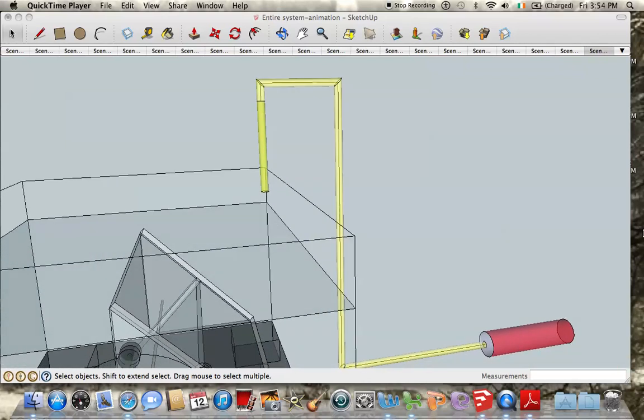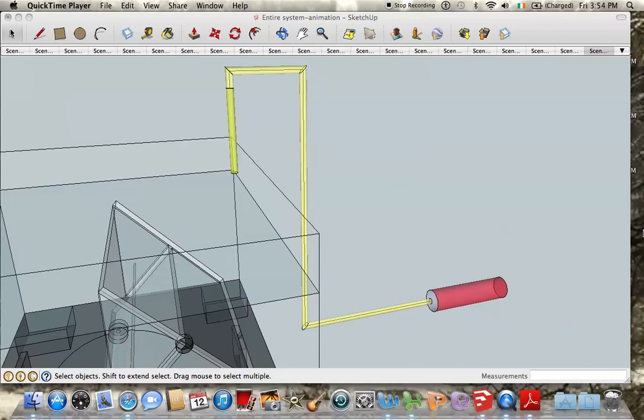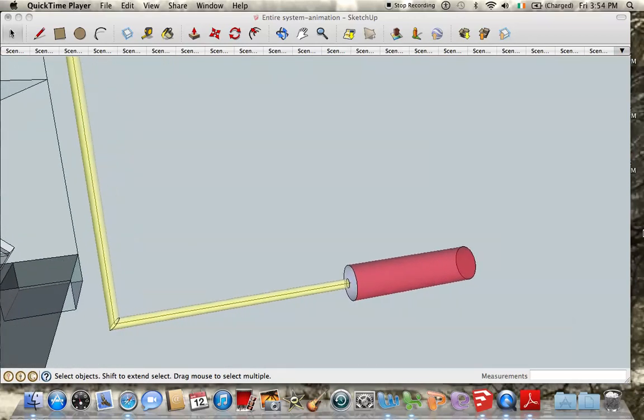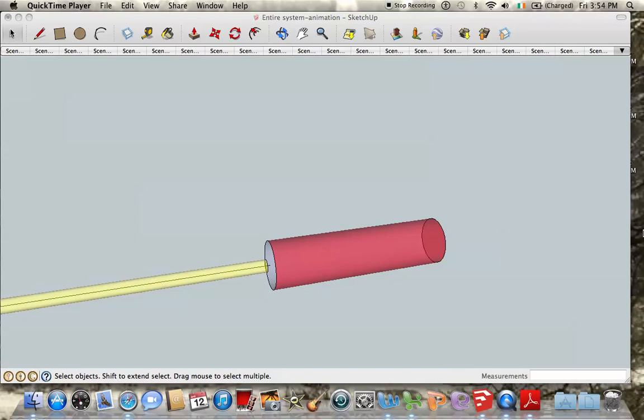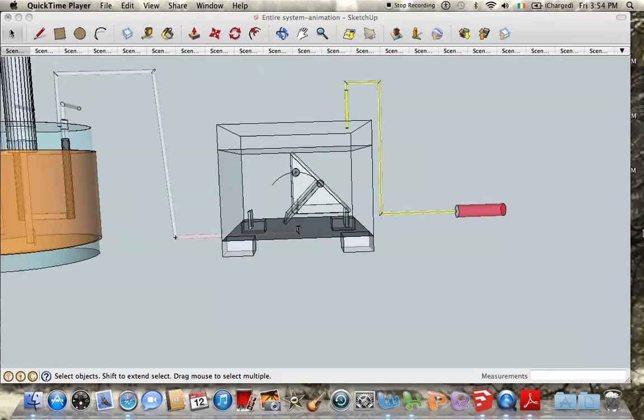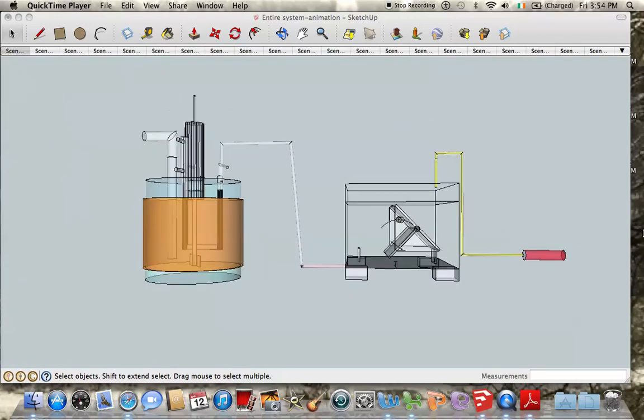The gas then passes along the yellow tube and into biogas storage bags, seen in the red colour here. These biogas storage bags come in many different shapes and sizes. They are very economical and they're the best way of storing biogas. Everything you can see in the diagram here is to scale, bar the diameter of the pipes, which in reality is probably a good bit smaller.